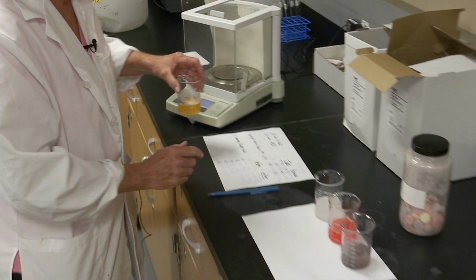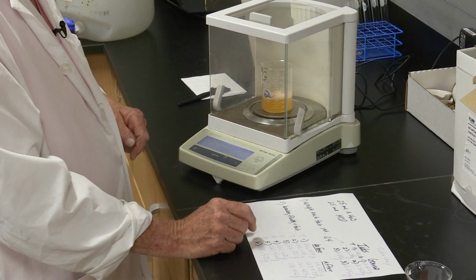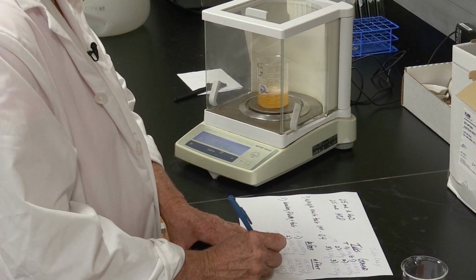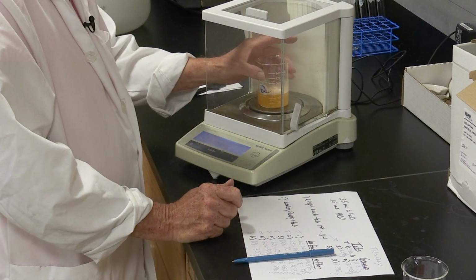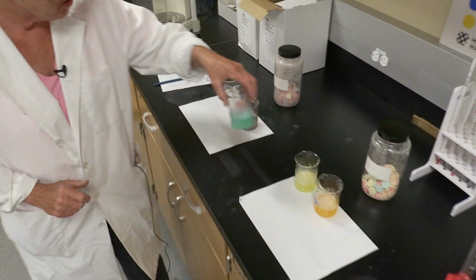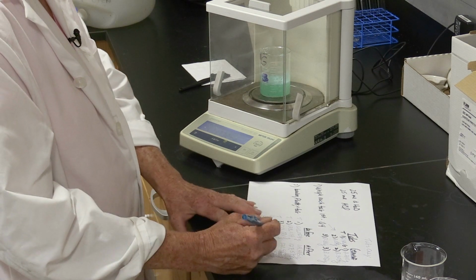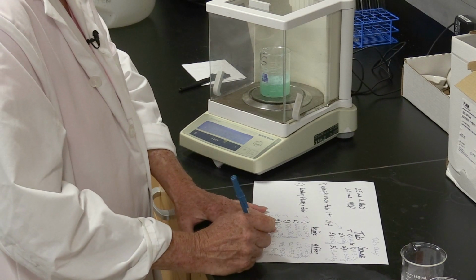Generic 2, 119.846 grams. And the last generic, number 3, 117.724 grams.